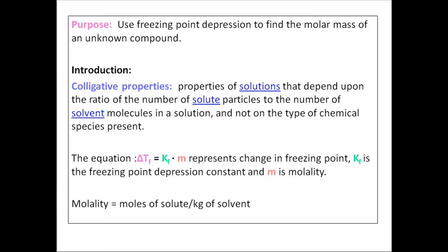The purpose of this experiment is to use freezing point depression to find the molar mass of an unknown compound. For introduction, colligative properties are properties of solutions that depend upon the ratio of the number of solute particles to the number of solvent molecules in a solution and not on the type of chemical species present.